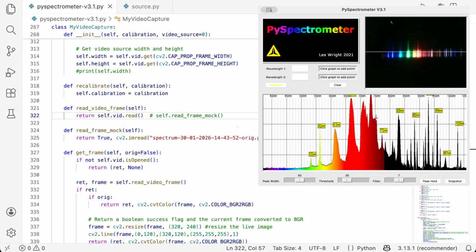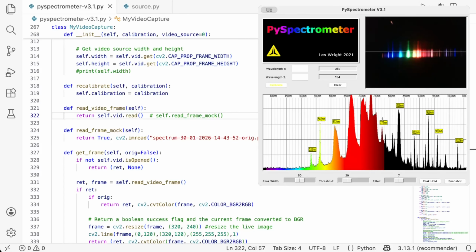Technically the calibration is easy. I need to click the point and I can see the coordinates in pixels. And I need to find the proper wavelength. So here I have two values in pixels and they have values of 630 nanometers and 405 nanometers. Of course, I don't want to enter these values every time, so I will just update the Python code and let's see how it works.